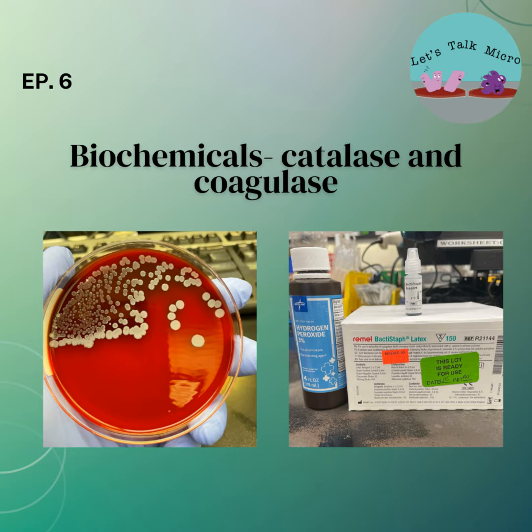So we're going to start with the first one, the most common one, catalase. What do we use it for? Well, we use it for gram-positive cocci and rods. What is catalase? So let's get technical for a moment.